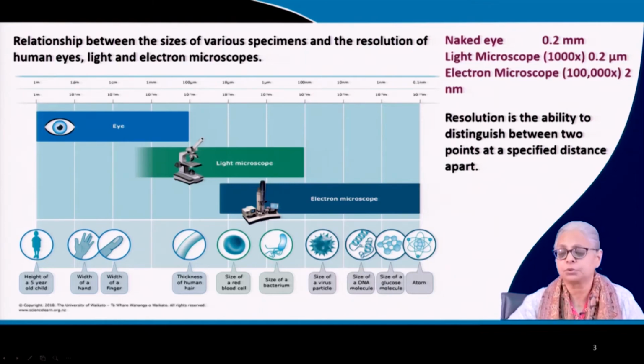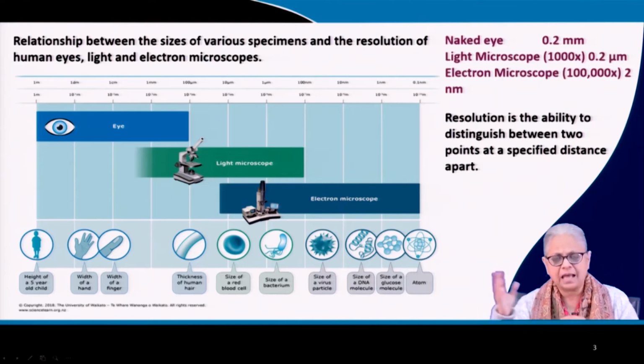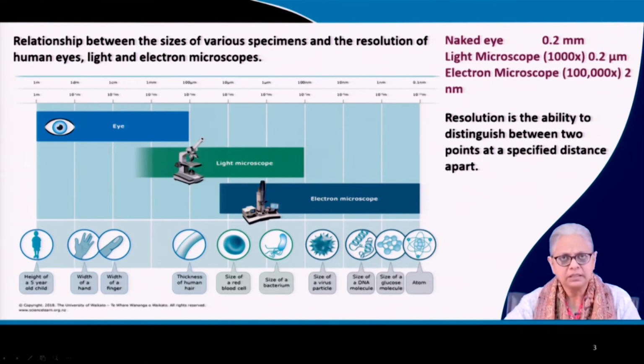These optical microscopes can give you at best 1000 to 1500 times magnification. You can't really do much with your normal compound light microscope that we all have seen in schools and colleges. They are relatively easy to find. It's not in the lakhs, it's a few thousands of rupees and so on. So it's relatively expensive, but not impossible for schools and colleges to have, right?